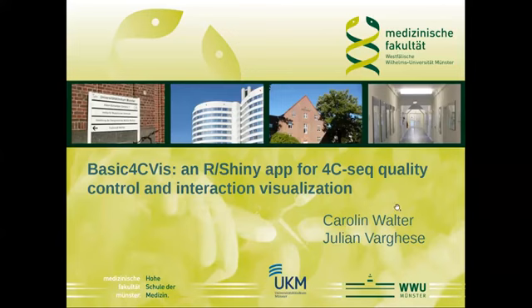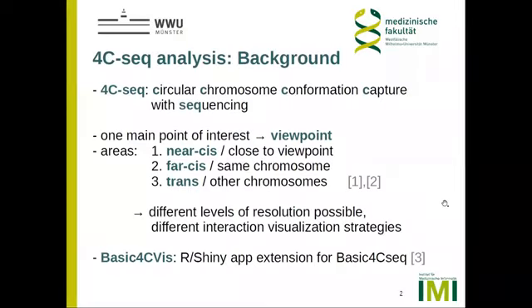Hello and welcome to the poster presentation Basic4CVis, an R-Shiny app for 4C-seq quality control and interaction visualization. First, a short background for 4C-seq analysis in general. 4C-seq is short for circular chromosome conformation capture with sequencing.